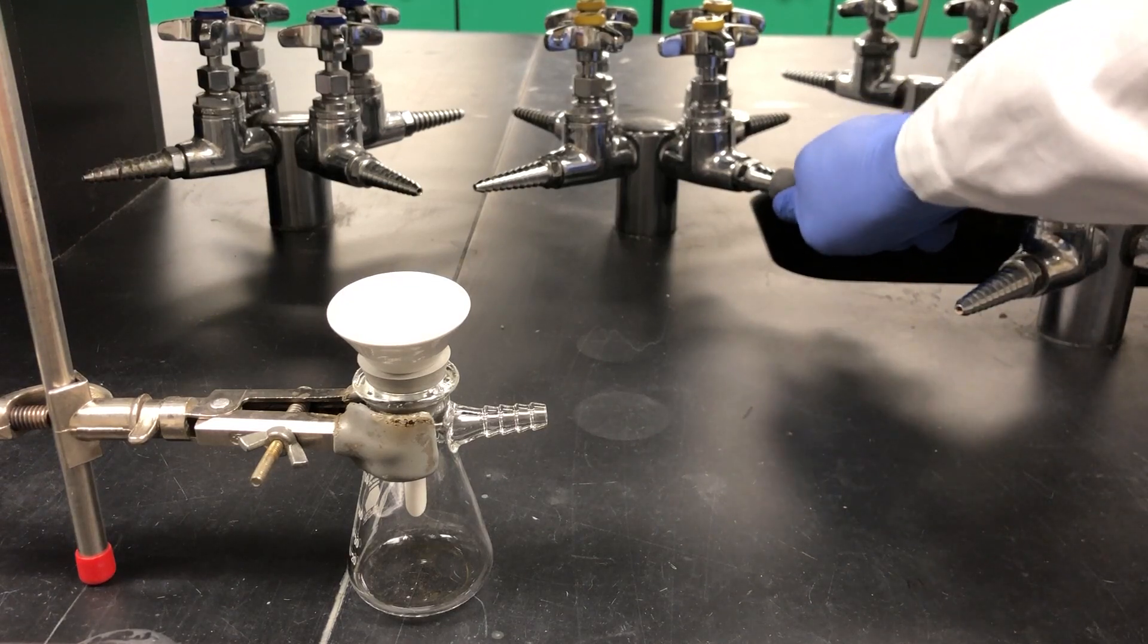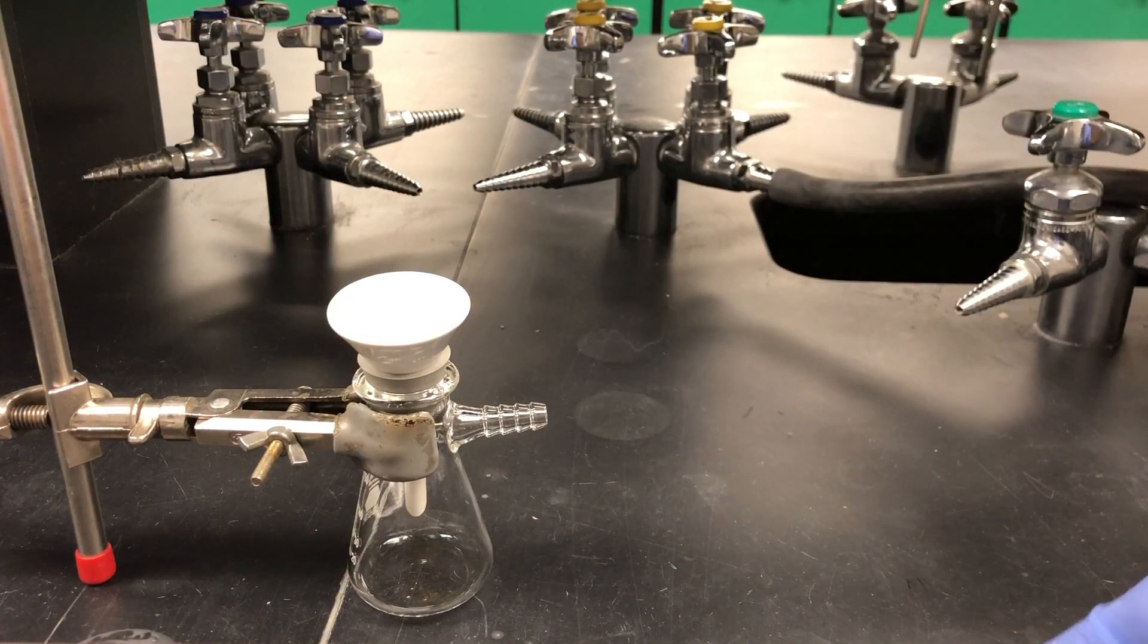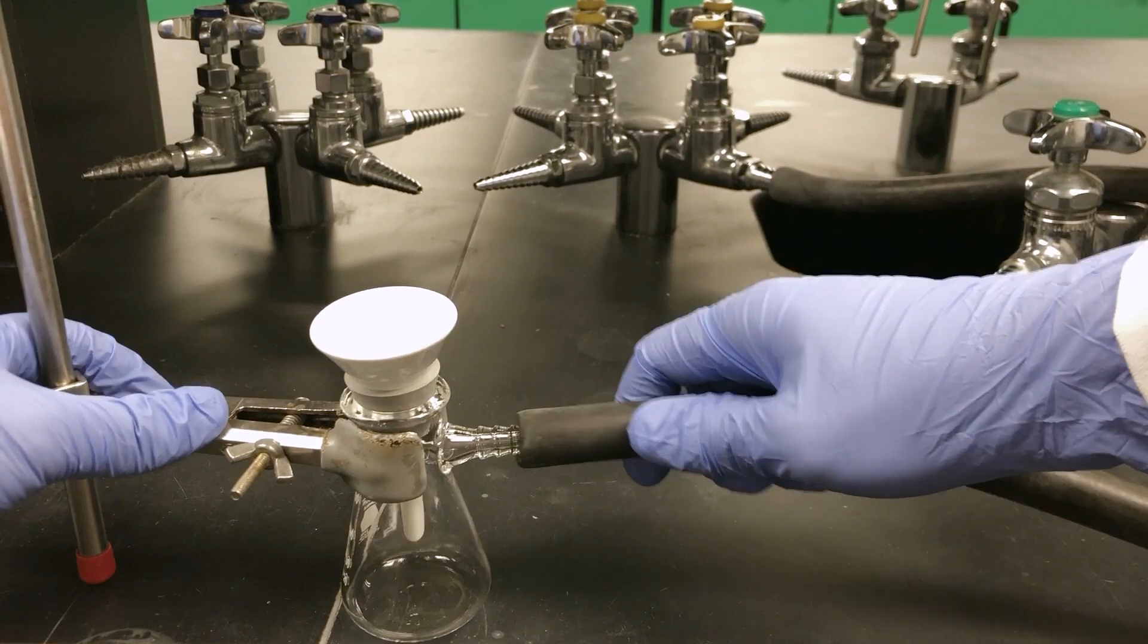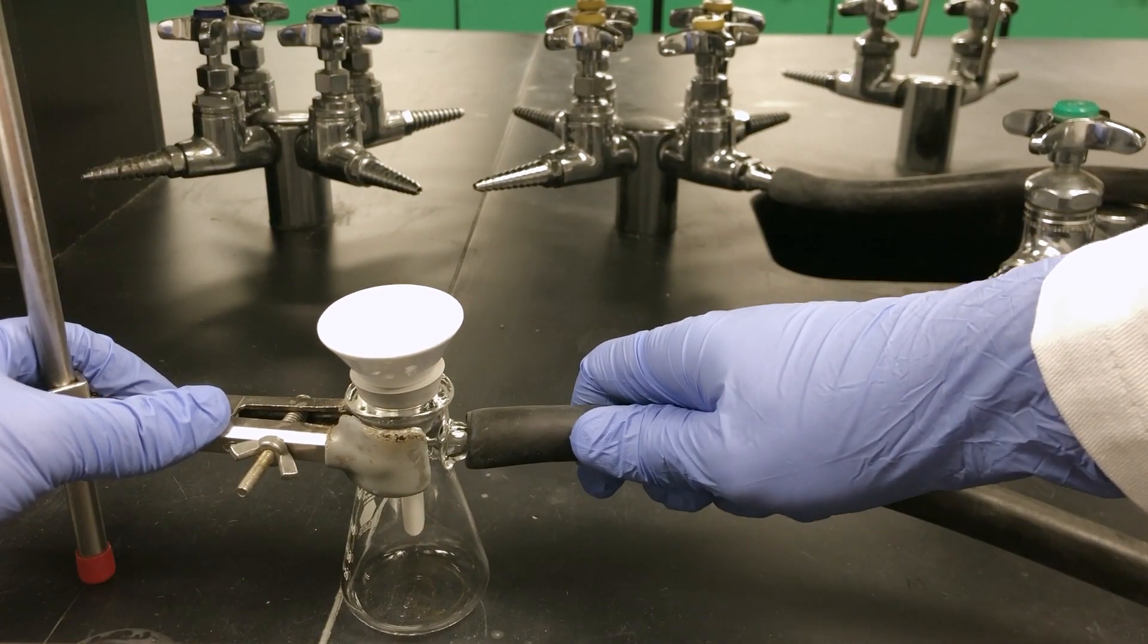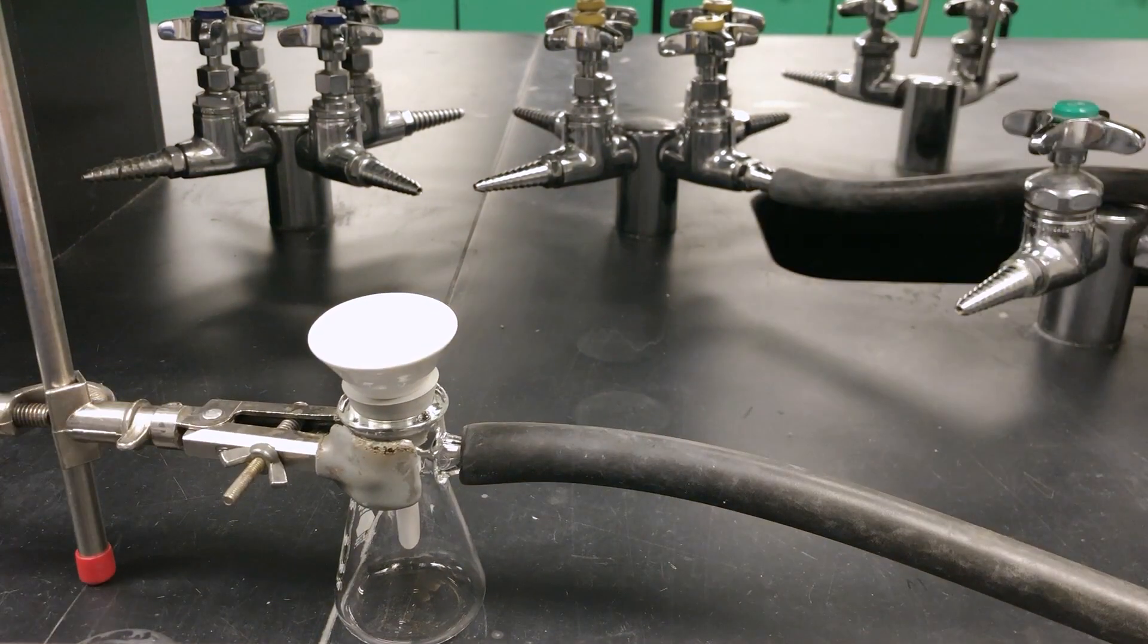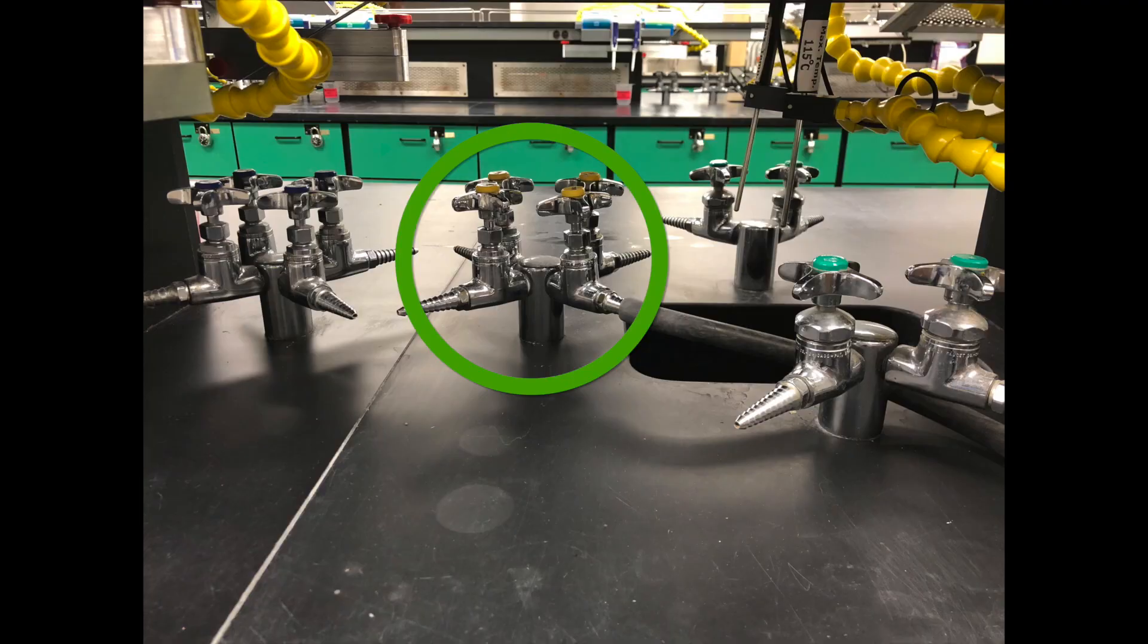Next, take your vacuum tubing and attach one end to the yellow vacuum tap, and the other end to the stem of the filter flask. Be sure to attach the tubing to the correct tap, as you do not want to attach it to the water or the gas lines.